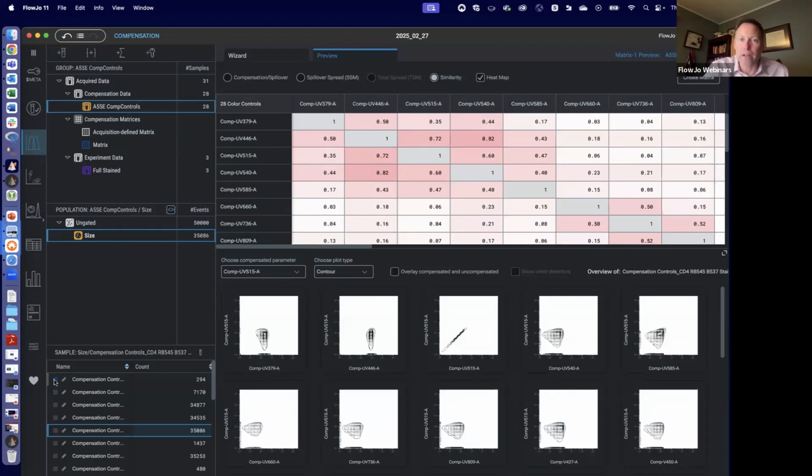All right, the chat looks like it is clear. And let me just make sure there's nothing in the Q&A box. All right, that looks clear as well. So there is a question that just popped up. Can FlowJo unmix data from Cytek cytometers? Yes. You just have to have the single stain controls. And so choosing spectral will be fine.